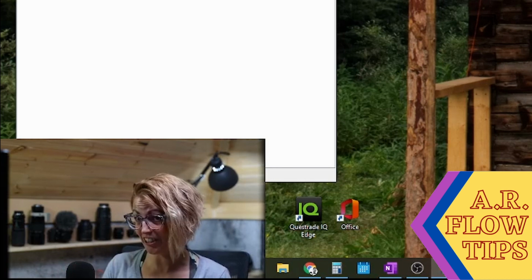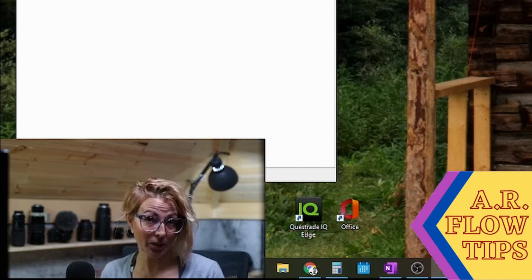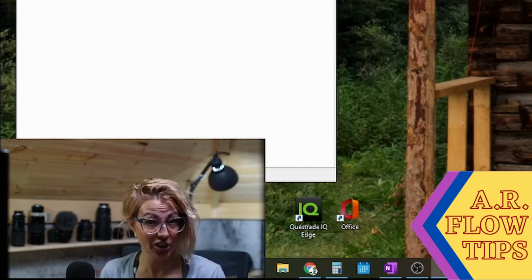So in today's session, we'll be looking at compensation. And in this case, I have a 13 color experiment in which we'll go through the compensation.